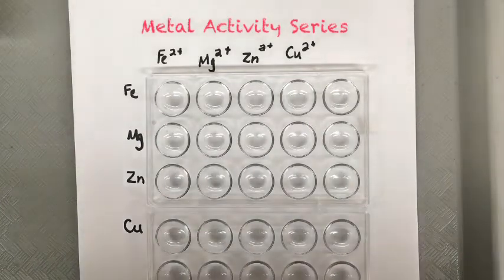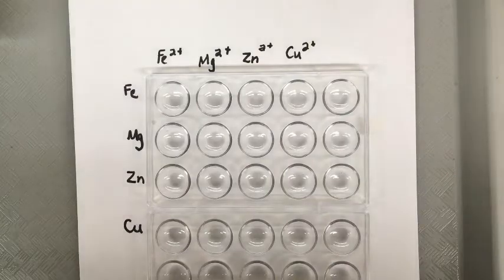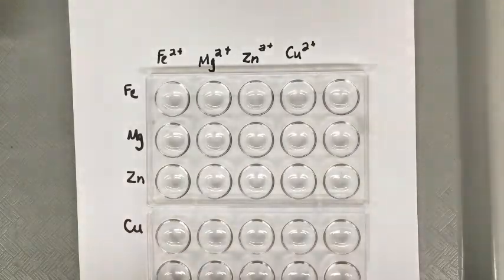In this lab activity I'm going to make a metal activity series and determine which metals are more reactive than others.